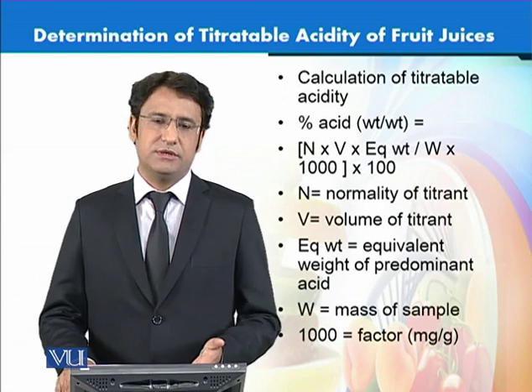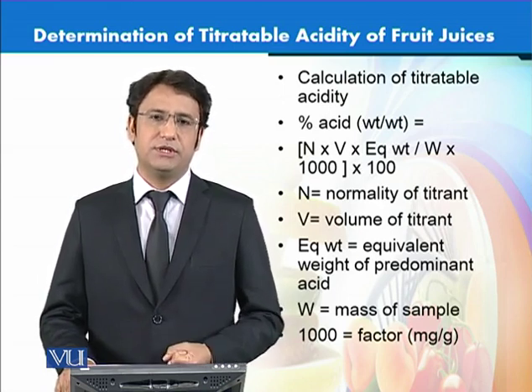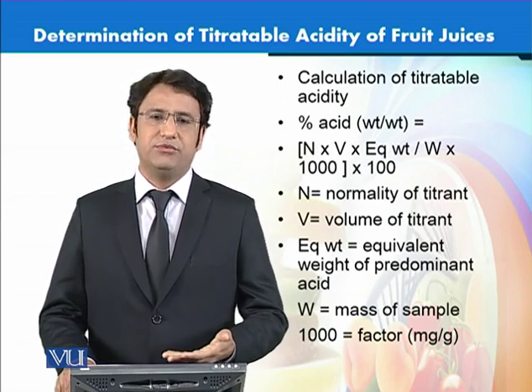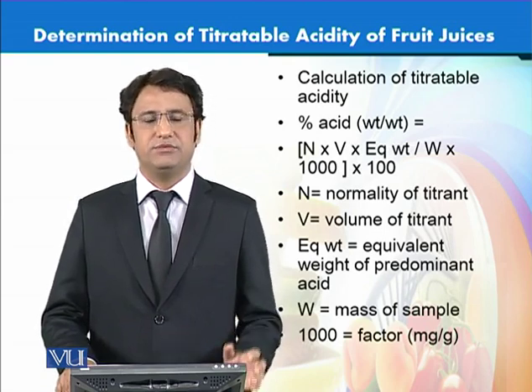So this was the method by which we measure titratable acidity in different fruit juices, and the same can be applied for general acidity measurements in other samples as well.